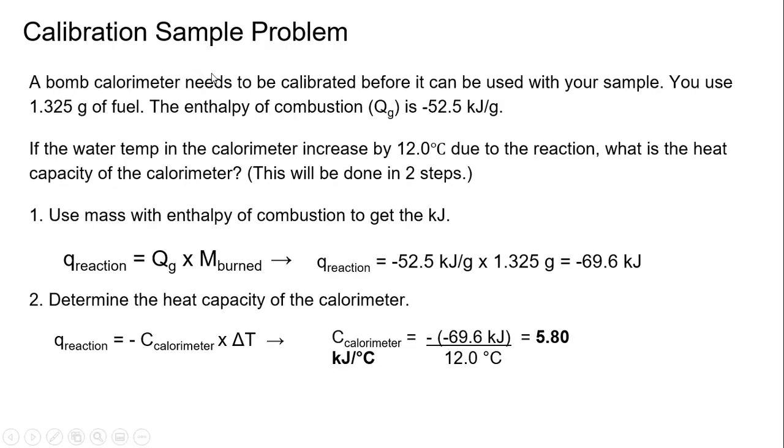So here's a perfect example of a calibration sample problem. I realize that this is a new chapter for you. You should have covered some in Chem 10. It's only going to get harder, and you really need to start jumping in and reading on this chapter in order to understand some of what's being stated here. A bomb calorimeter needs to be calibrated before it can be used with your sample.